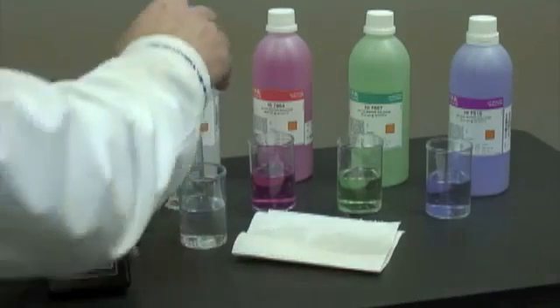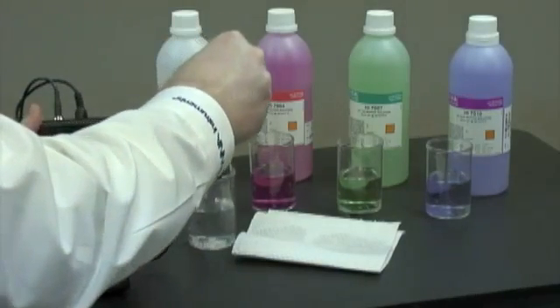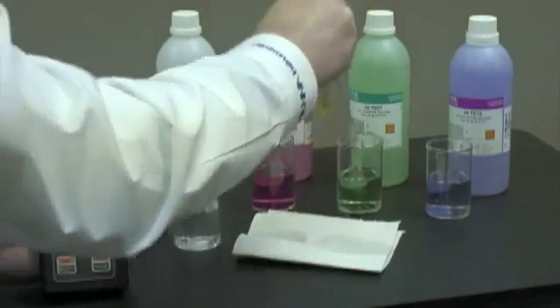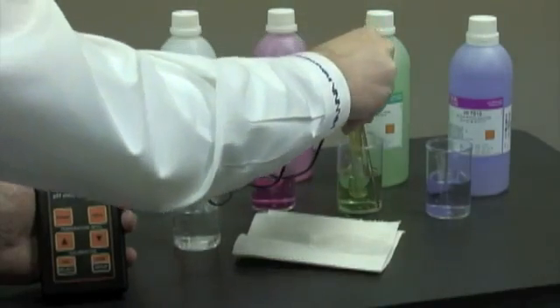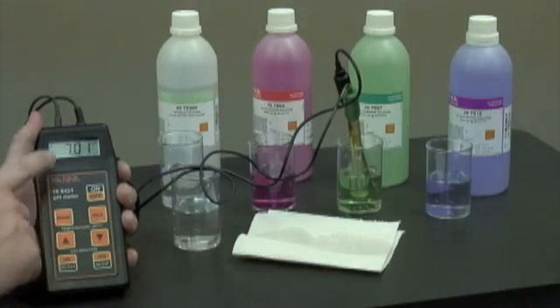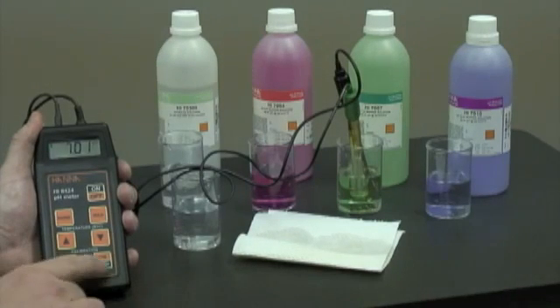Now that two hours has passed, we'll rinse the probe with some purified water and place it in the pH 7 buffer. We'll hit the calibration key and wait for a CFM to show up on the display. Once we see that and it beeps, we'll hit the confirmation button.